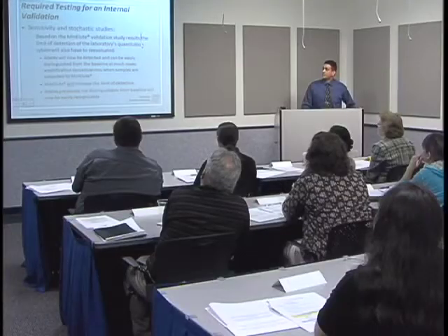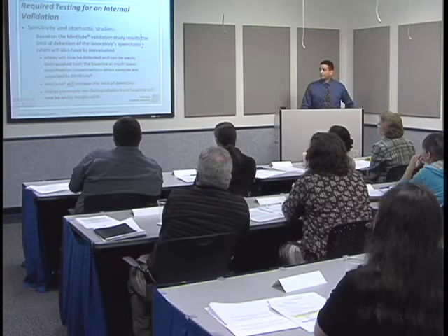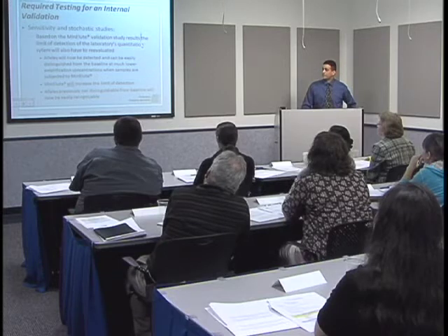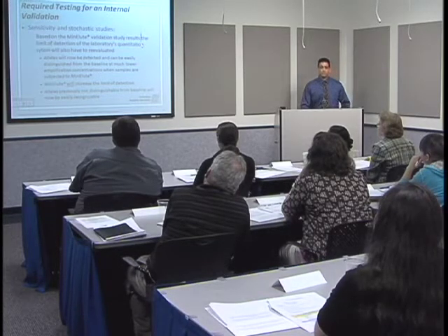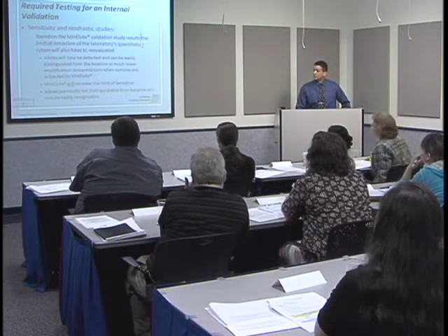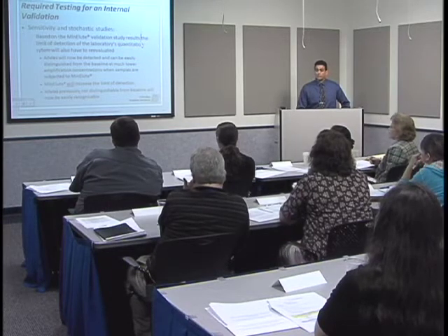Based on the MinElute validation study results, the limit of detection of the laboratory's quantitation system will also have to be reevaluated. Alleles will now be detected and can be easily distinguished from the baseline at much lower amplification concentration when samples are subject to MinElute. MinElute will increase the limit of detection. Alleles previously not distinguishable from the baseline will now be easily recognizable.